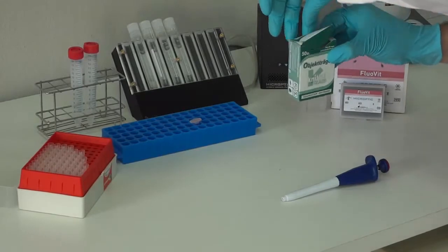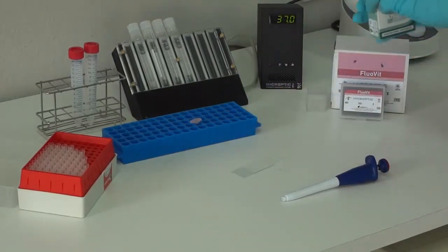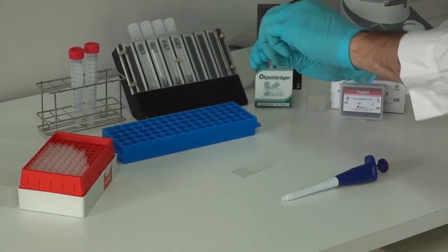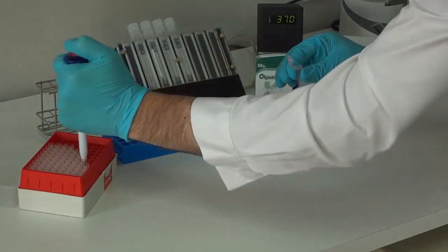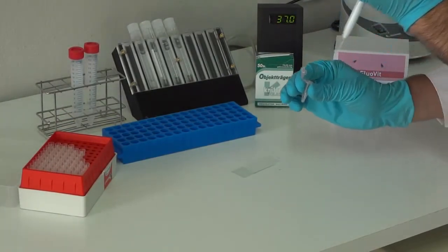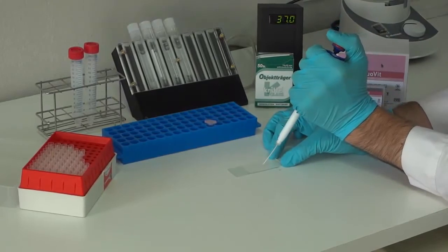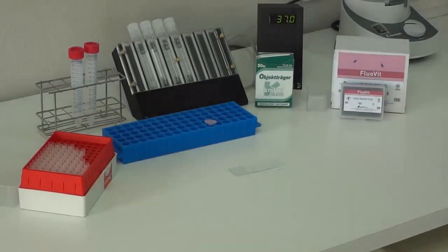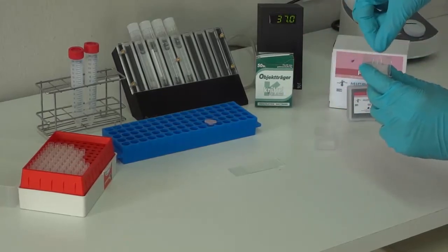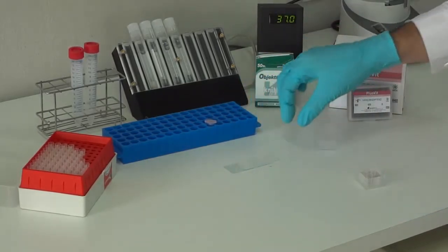Last step is to put a small aliquot of 10 microliters of stained sample on a standard slide. Cover with cover glass. And the slide is ready to be analyzed under fluorescence.